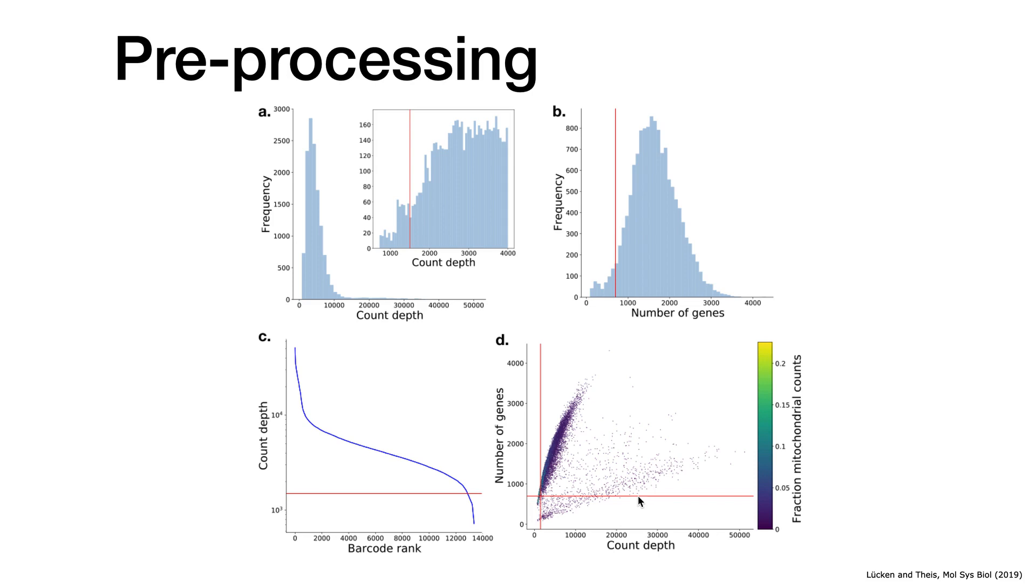The cells that are on this lower regime, so they have a lot of counts, a lot of molecules detected, and they have few genes detected. That's not a fault per se, but it's probably a different cell type. And if you make this kind of observation in your data, you would probably want to look at the data normalization that takes this into account.